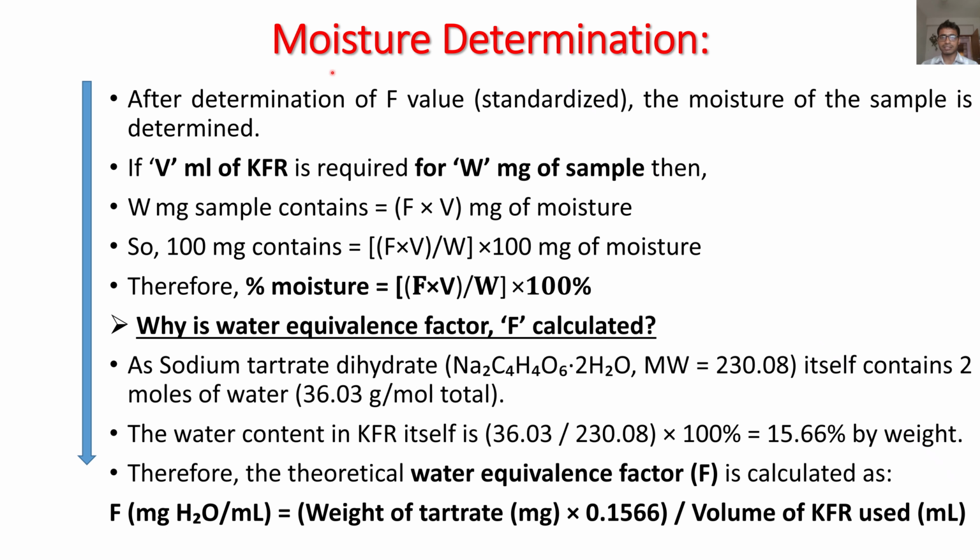Now, this is our final segment. In this segment, we will practice some problems like determination of water. We have already said that we require some volume of KFR for some weight of sample. For example, I have given you 5 gram of sample, and I'm telling you to please determine the moisture content of this 5 gram of sample.